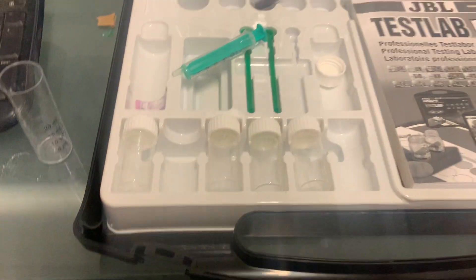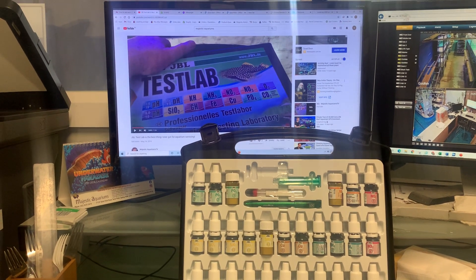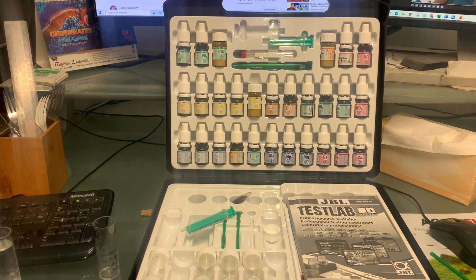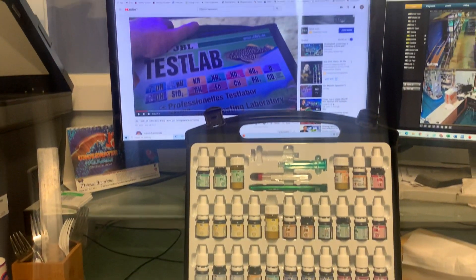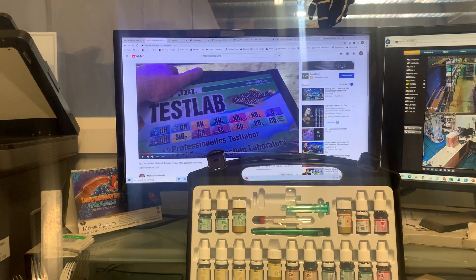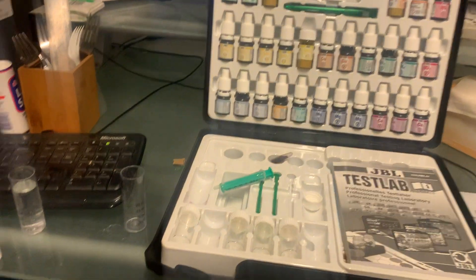But if you are getting too much algae in your tank, phosphate is something to look at. That's how you do a phosphate test from JBL. There are many unreliable phosphate tests on the market, so just be aware of that. If your tank's running well, all good. If you're getting trouble, particularly with algae, it's good to bring a sample of your water down to the shop along with a little video of the tank running, so we can guide you and make sure your tank is thriving the way it deserves to.